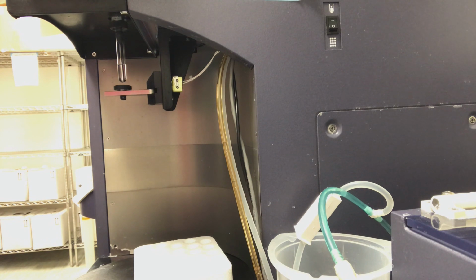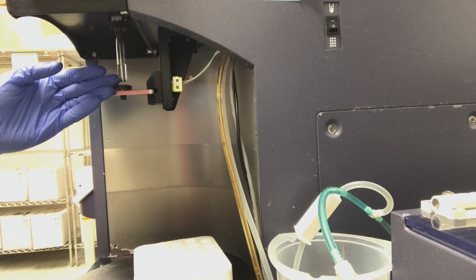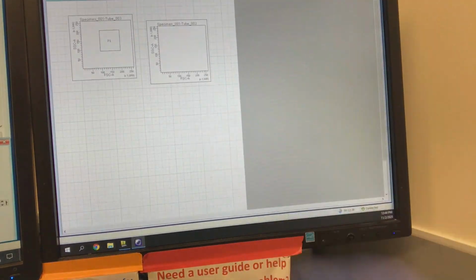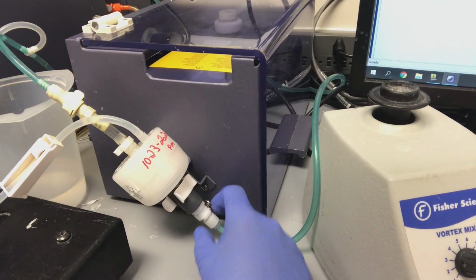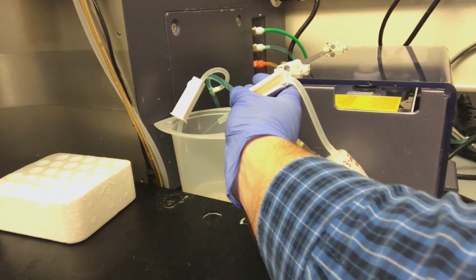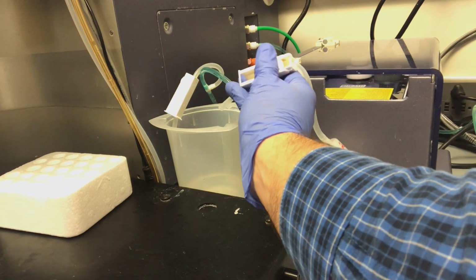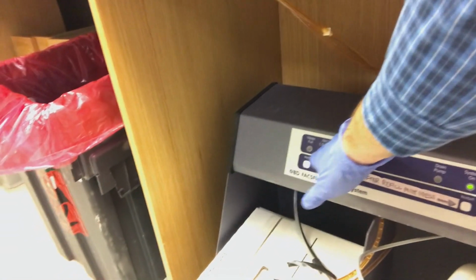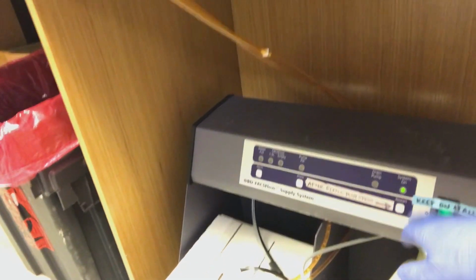So as I mentioned, all samples must be filtered before running on this machine. However, clogs happen. If you think you have a clog because you have a sample tube loaded, there's clearly sample there, but you're not seeing any events based on the threshold rate or events in your plots, please first check that this connection is secure and that there is pressure coming out of that filter. Also, make sure that your tanks are full and empty respectively, and that there are no sheath tank alarms on.